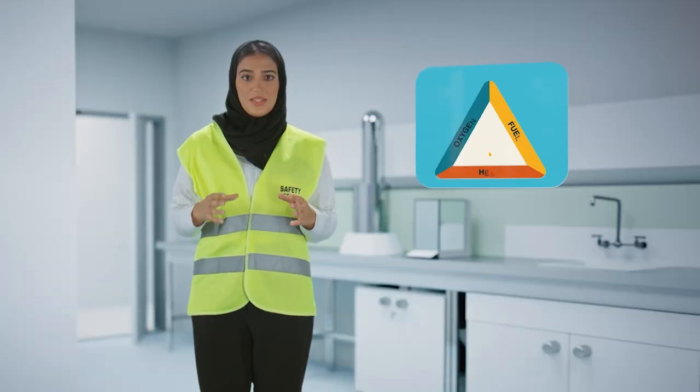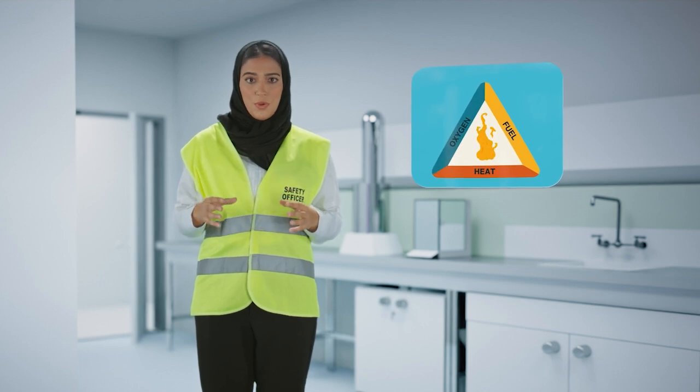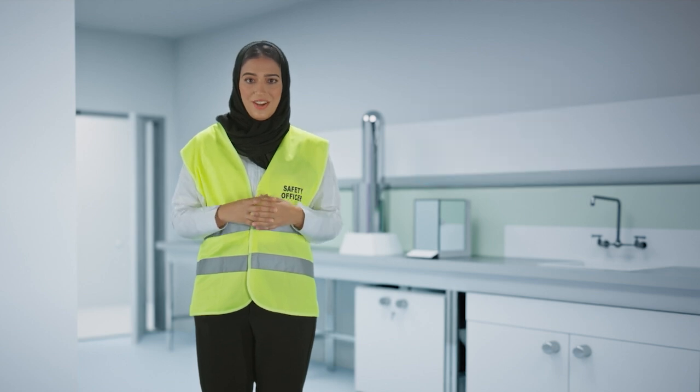Consider the three components of the fire triangle: heat, fuel, and oxygen. All three components must be present for a fire to begin and continue. Removing one of these components will prevent the fire. If a fire unexpectedly occurs, it could be that a quick response on your part will prevent a small incident from transforming into a bigger one.